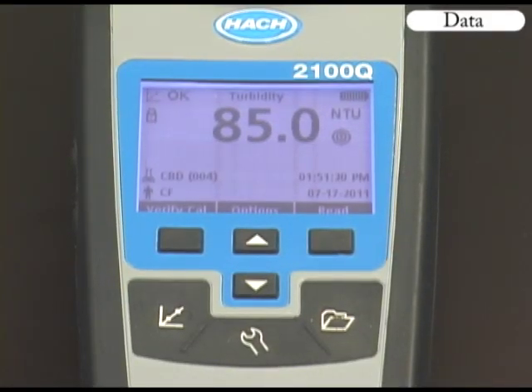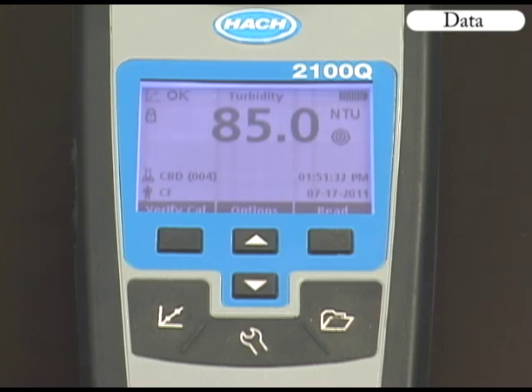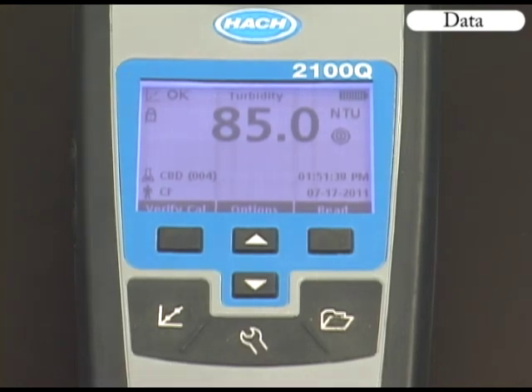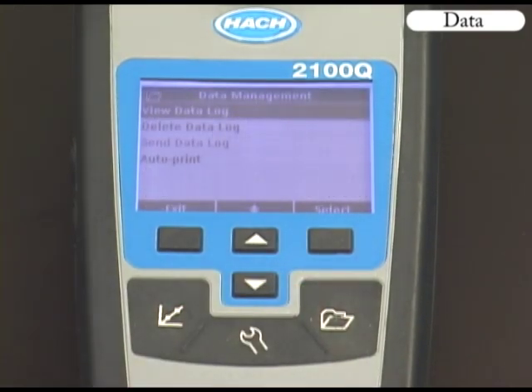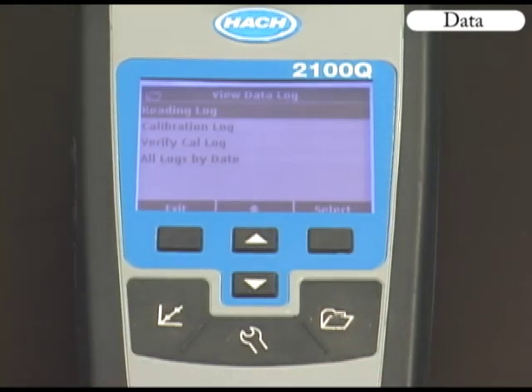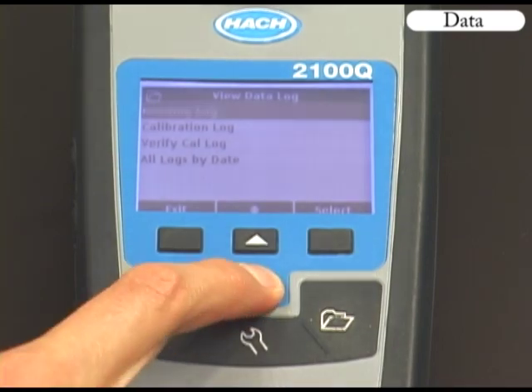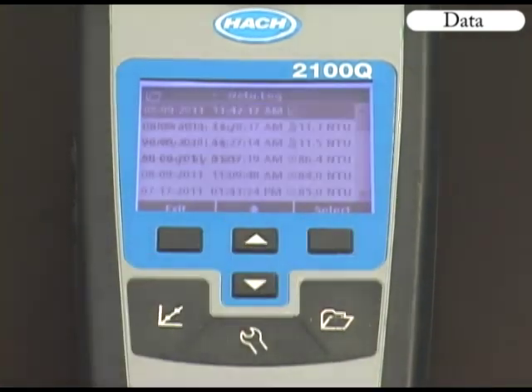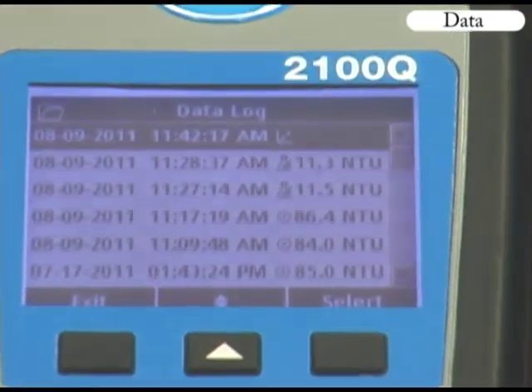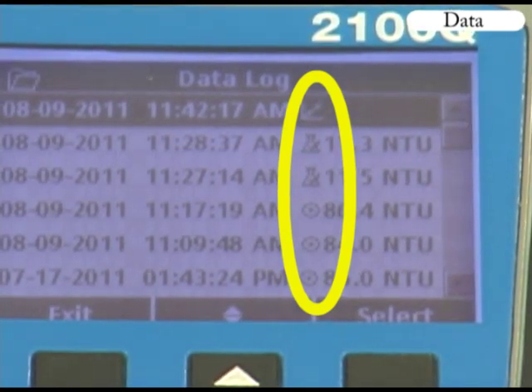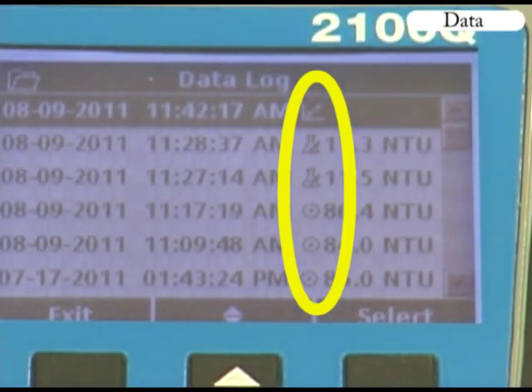The 2100Q has the ability to store 500 readings, 250 successful verifications, and 25 successful calibrations. To view this data, press the Data Management key and select View Data Log. If you select the Reading Log, you will view all sample data listed by date. If you select the Calibration or Verify Cal Log, calibration or verification data will be listed by date. If you select All Logs by Date, an icon will appear to show whether the stored data is from a normal reading, calibration, verification, or rapidly settling turbidity reading.